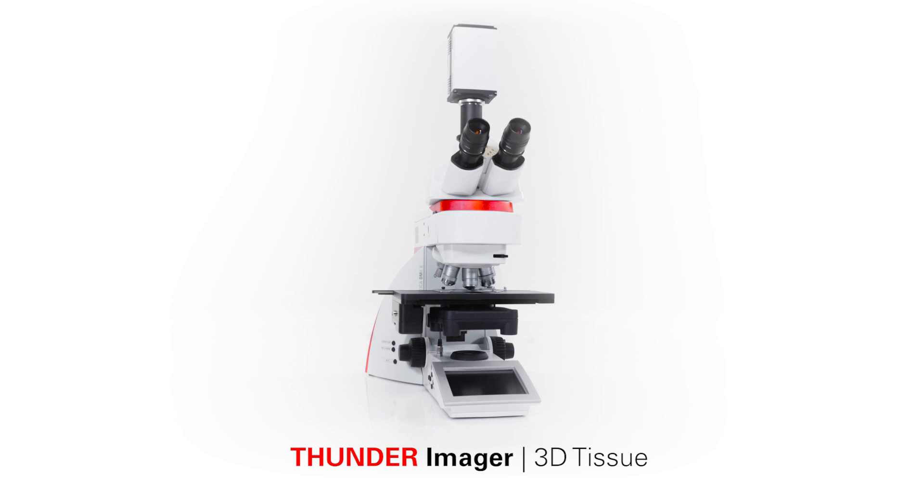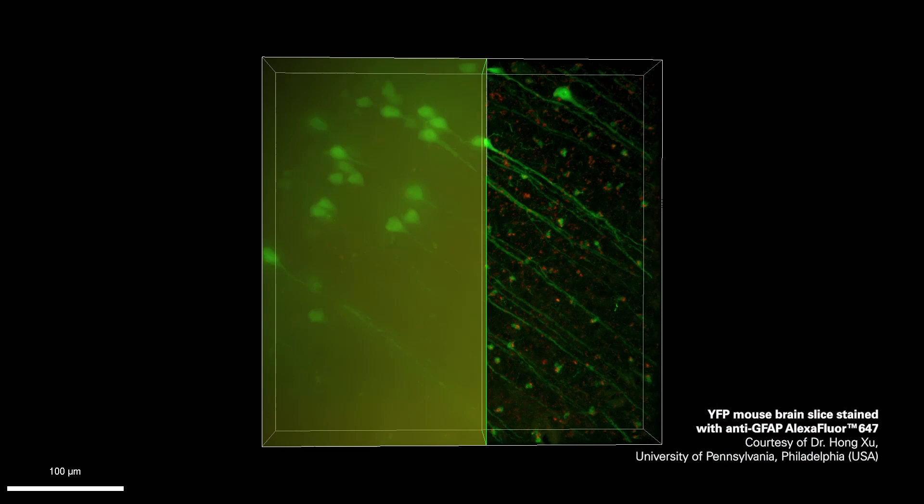The Thunder imager offers instant removal of the out-of-focus blur by computational clearing. You get crystal clear images, which enables you to follow the finest structures within these tissue sections.